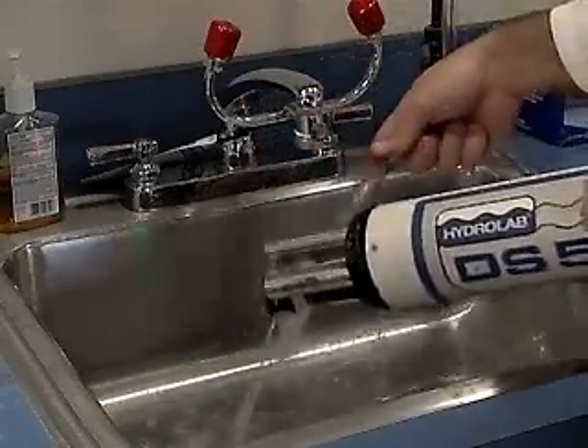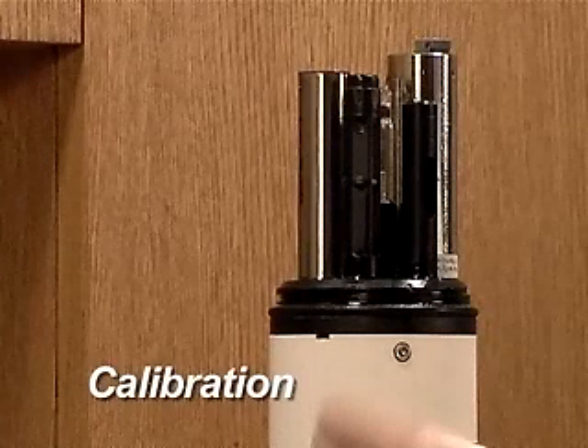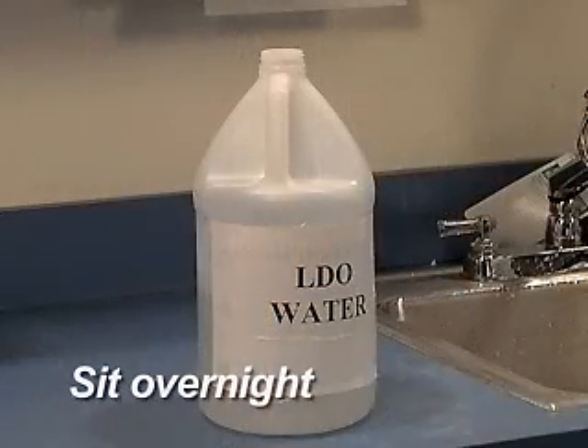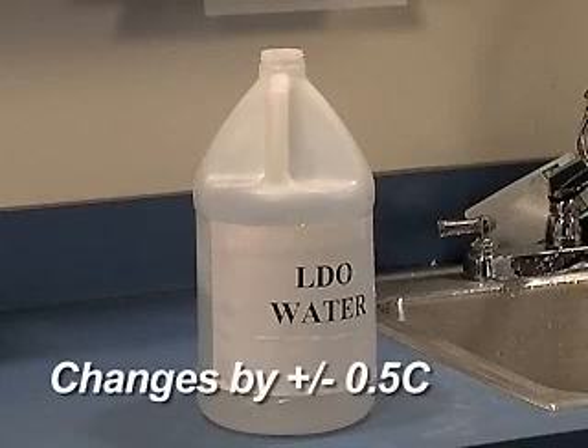When the sensors are clean, the LDO is ready to calibrate. The LDO sensor compensates for the temperature of the water. To perform an accurate calibration, it is important that the temperature of the water remain constant during the procedure. The easiest way to do this is to allow the water used for calibration to sit overnight in an open container until it equilibrates to room temperature.